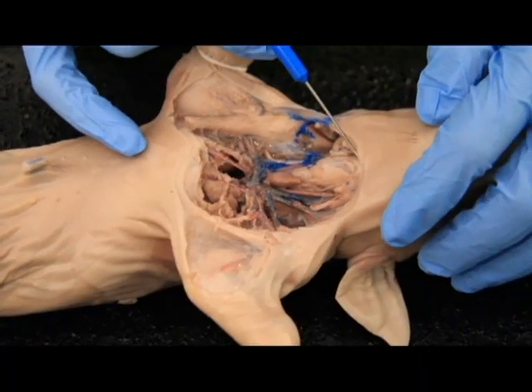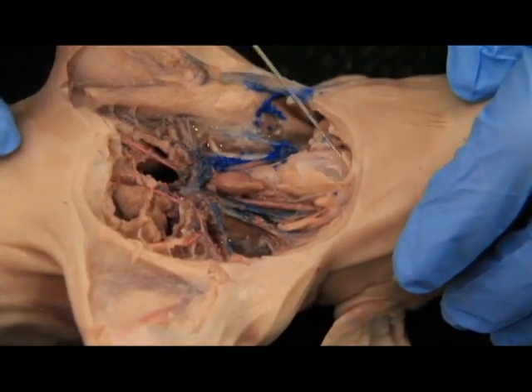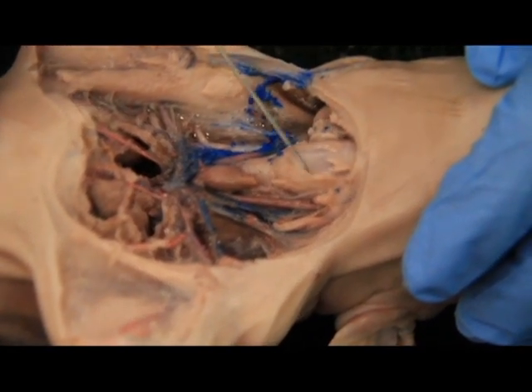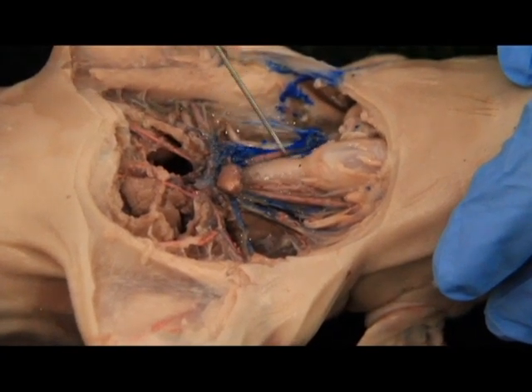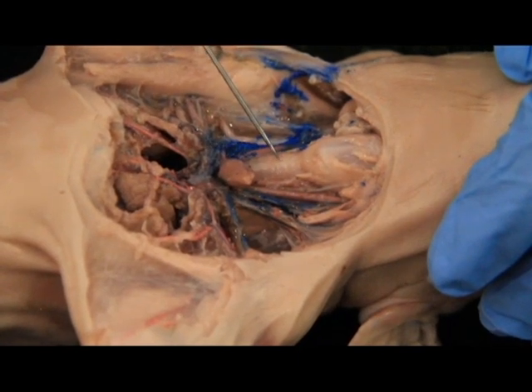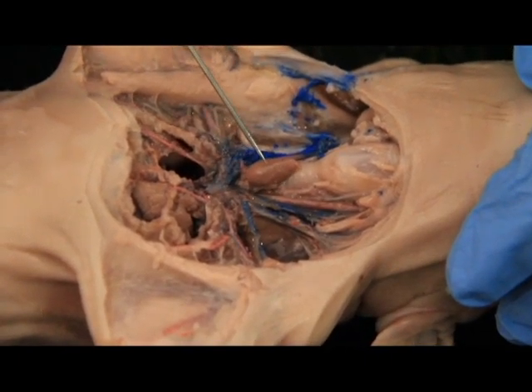So now we've cleared away all of this fatty tissue in the neck to reveal this large ball in the throat. And again, that large ball in the throat, that's your larynx. This is your voice box right here. So if you were to follow this down right here, this bumpy tube in the throat, that's your trachea. Very, very distinct structure right here. That's your bumpy tube, that's your trachea. This is your airway, okay? Sitting below that, this tiny little bean-looking guy, this is your thyroid gland.